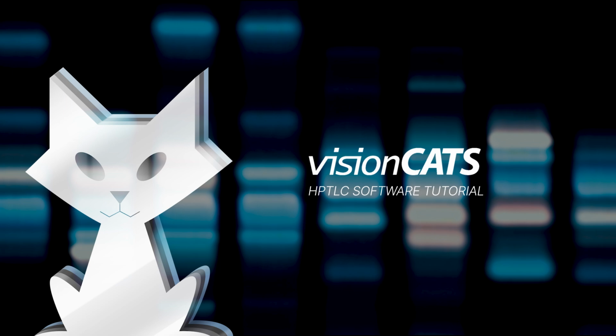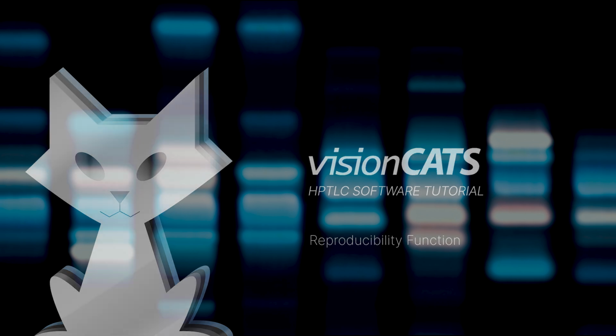Welcome! In this tutorial, we'll explain the reproducibility functionality in visionCATS, which allows you to assess the consistency of your analysis within the same plate and across multiple tracks. The reproducibility function evaluates the variability of peak heights or peak areas assigned to a substance, providing a measure of the method's reproducibility.